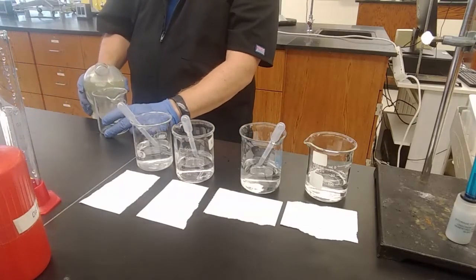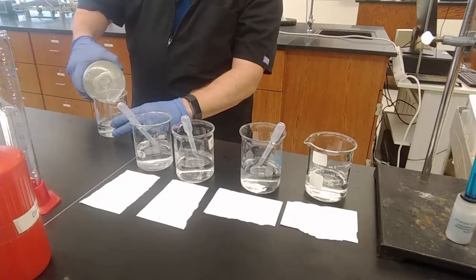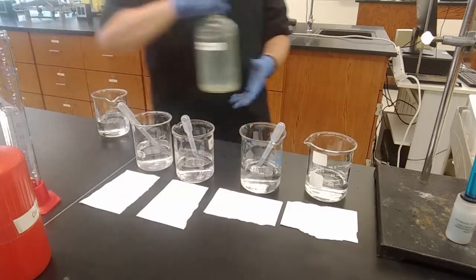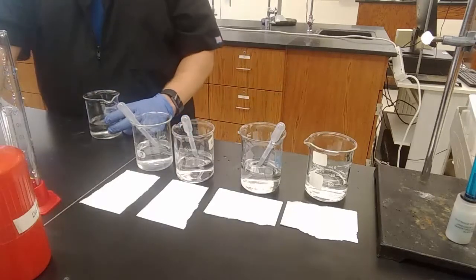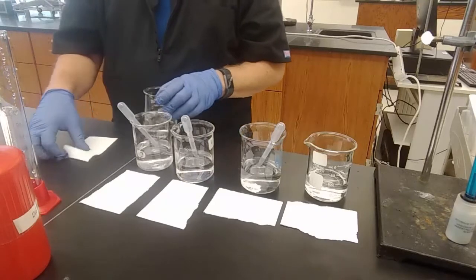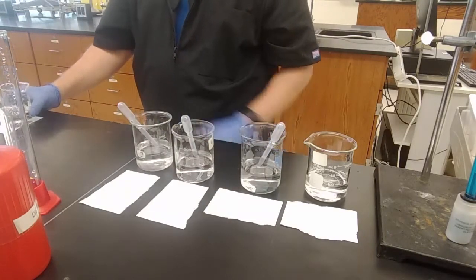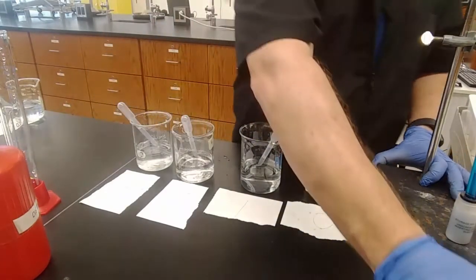We would have a pOH of 0, which means that the pH is 14. But we don't really go over converting pOH into pH in the 127 lab or the 127 lecture. But this is pH 14. I'm not going to have enough room down here to widen out my angle later. I'll put it over here, right on the edge of the frame. We can sort of see it. Maybe I'll shuffle some things around here.